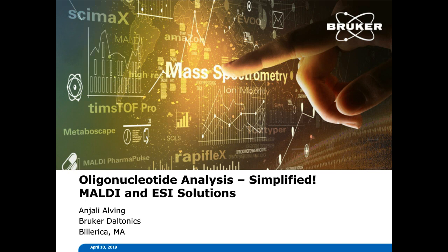Thank you, Jeff, for the kind introduction, and thank you all for your participation. Today, we will talk about oligonucleotide analysis by mass spectrometry, the challenges that we encounter and solutions that are offered in terms of hardware as well as software. We will also look at examples of oligonucleotide analysis from different companies.